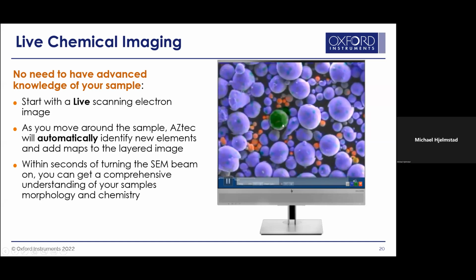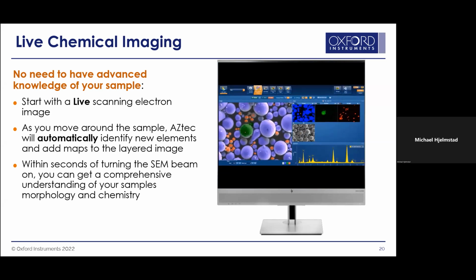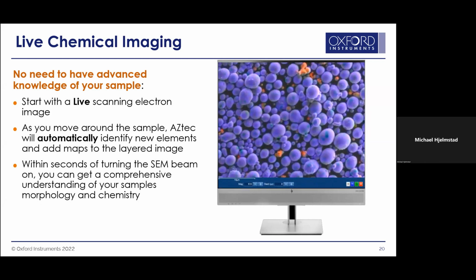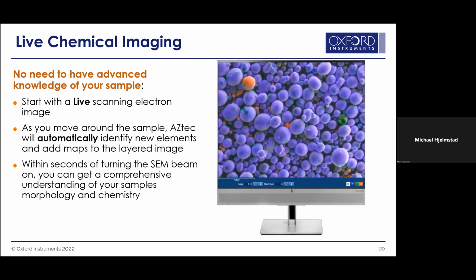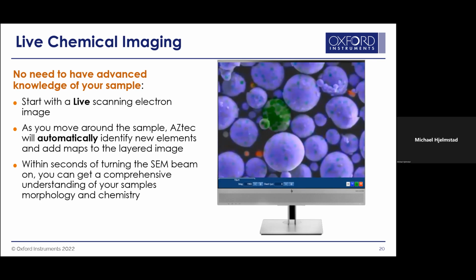And it's like, well, what in the world is that? And when we actually do our analysis on it, we find out that that's a nickel particle that's buried in it. And all of a sudden you realize that this great additive manufacturing pure powder isn't exactly as pure as we thought. And rather than trying to hunt around and find the nickel particle in the haystack, so to speak, we've just found it by driving around and taking advantage of the Aztec Live capability. So this is something that can really be beneficial if you're looking at something completely blind. If you go, I've got an idea where to look on this sample, but who knows?